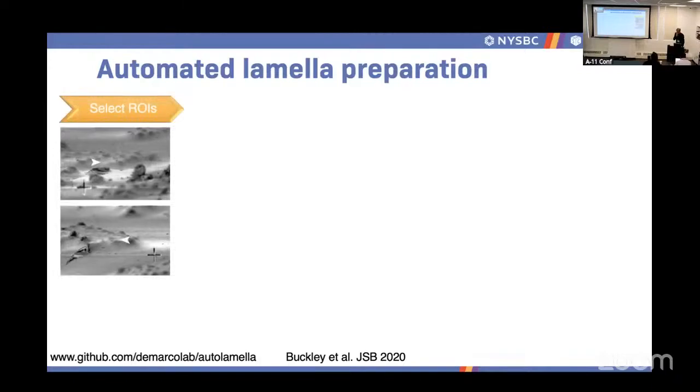Some years ago, we sort of introduced the automation on the FIB. This was to preserve our livers from drinking too much beer at the sessions, so we could do something else more constructive. But generally speaking, this is what you do. And again, every workflow is going to be the same. You're going to be doing a little bit more steps eventually, but it's going to boil down to these.